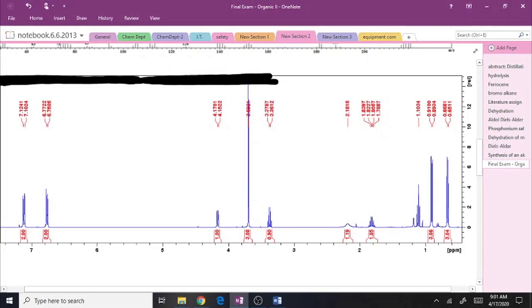Here we have another NMR spectrum. This one is a little more complex. Here we do have essentially whole number integrations. These two, for example, are definitely whole numbers. This is close enough that you can round. But again, recognize that this is in the region of OCH. Given the integration, it is 3. This peak, likewise, at 4.1 is also in the alkoxy region, so this is again an OC.